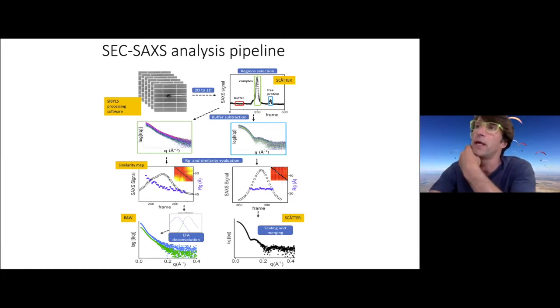So you already get the scattering profiles for each frame, but you also get the final curve for the peak. In the case of split peaks, especially when the protein complex shows some kind of transient complexation, where the first and second peaks overlap each other, we are not doing this kind of deconvolution for you, but I will show what is possible.